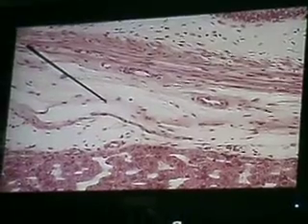epithelium. Now the perimuscular coat is this one. Peri. So yung katabing coat ng inyong fibromuscular. So the perimuscular coat is this portion here. Okay? And then, it is composed of your dense, irregular connective tissue.